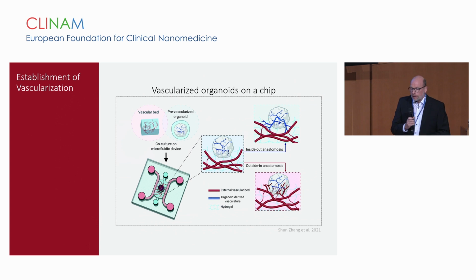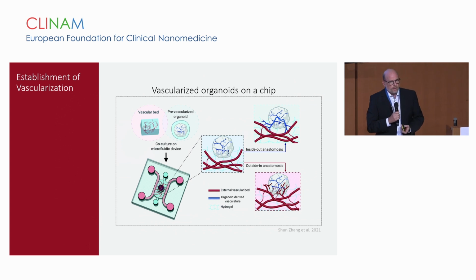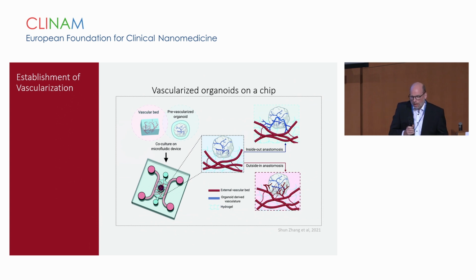So the next topic is how we get the vascularization into the organoid in a chip. There are some chip designs which are already described, which are commercially available. This is our starting point, and hopefully in the process of using them, we may come up with our own designs, and colleagues at Empa have all the tools that we could actually introduce our own future design. But without vascularization, I think these organoids do only half of the job they should do.